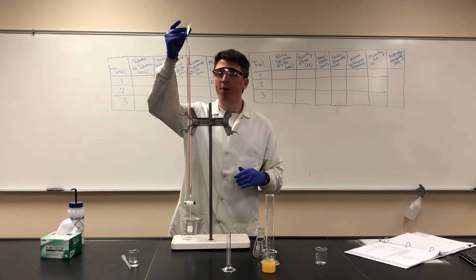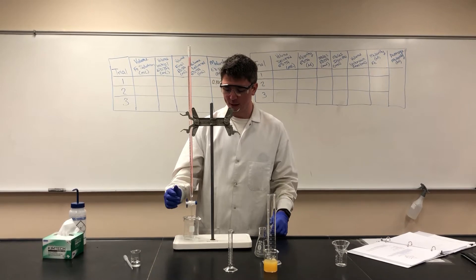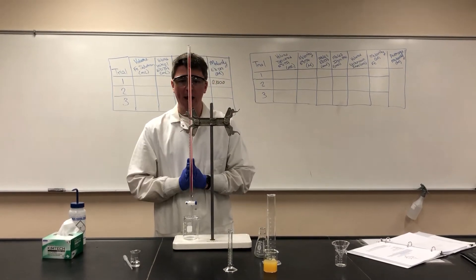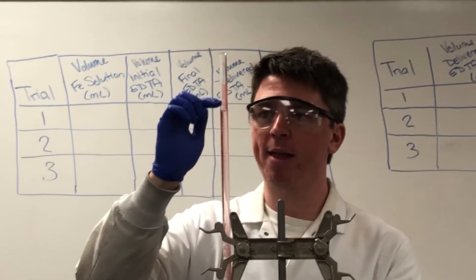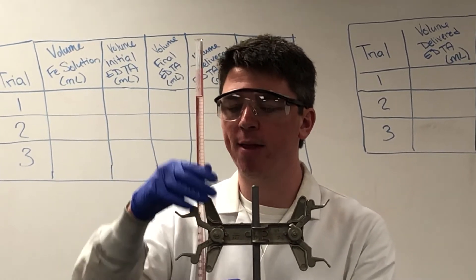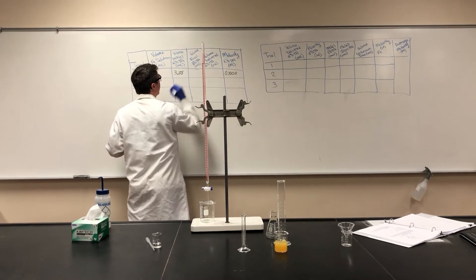We'll be recording our starting and ending volumes to know exactly how much volume we delivered. To make sure there are no air bubbles trapped, always open your stopcock and drain a little bit of your titrant out before you start — now we know there are no air bubbles. The burette is working correctly and we can record our starting volume. Between the 3.8 and 3.9 increments, we can estimate that next decimal place, so our initial volume is 3.88 milliliters.